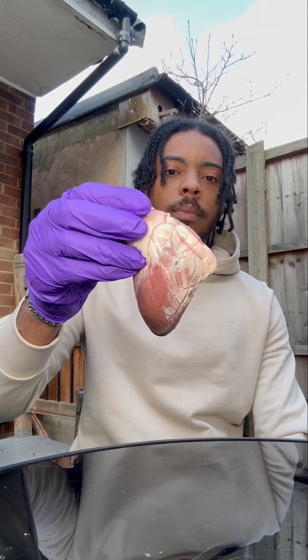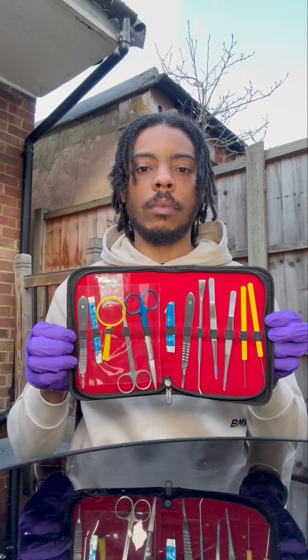I've got a sheep's heart here and we're going to dissect it. So we need this dissection kit.